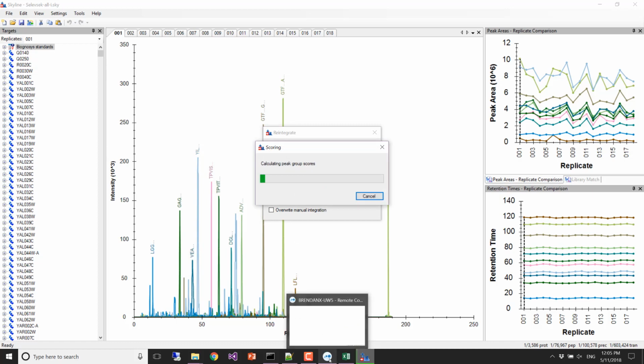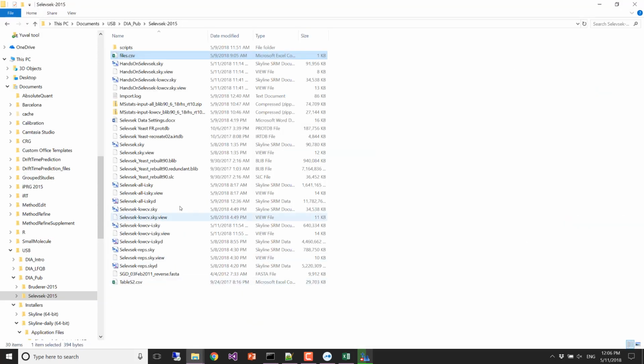Although I seem to be having some problems with memory. This step is also fairly memory intensive. And don't worry if everybody's been through this enough times. You kind of get the series of steps that we're doing. And we're trying to create the reports that we're eventually going to analyze with Mina. While this is calculating, I will show you those reports.